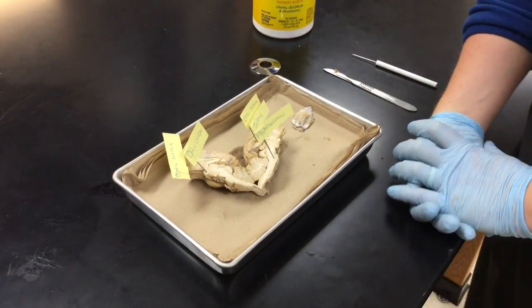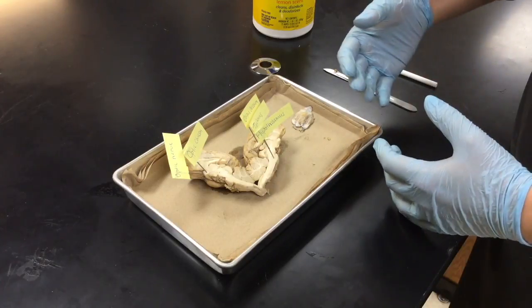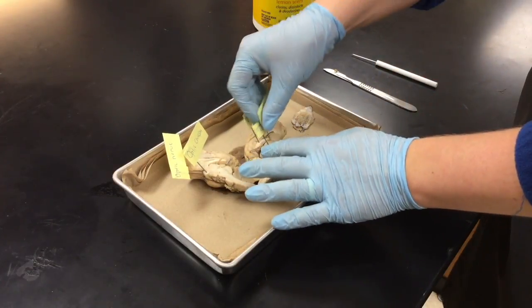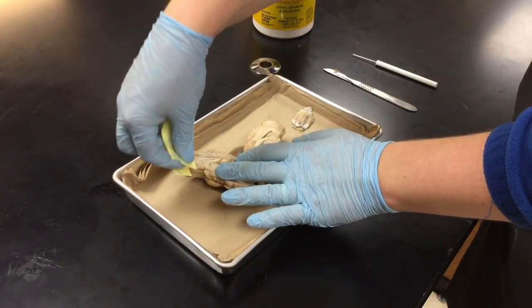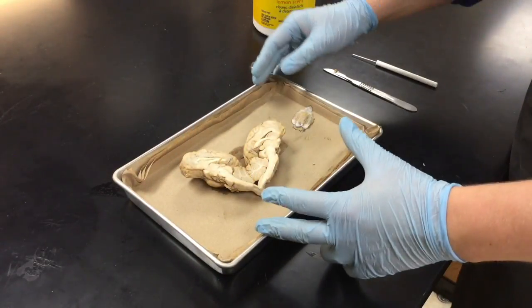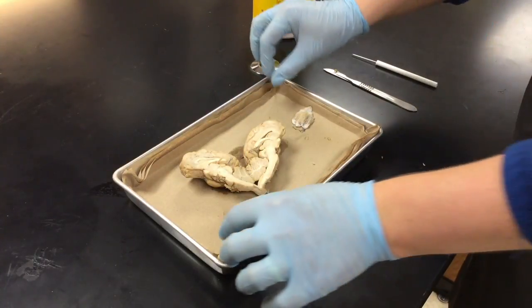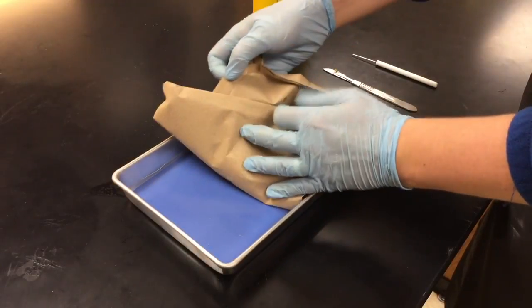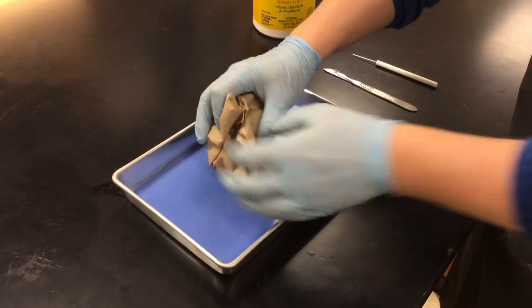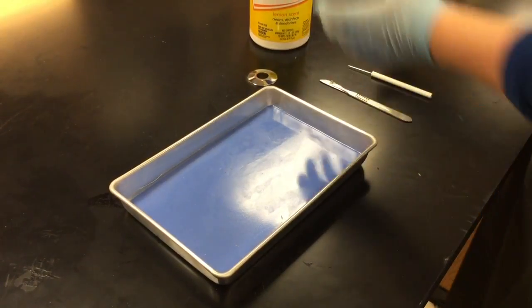Congratulations, you have finished your brain dissection, and it's now time to start cleaning up. So to clean up, what you're going to do is remove the remainder of your flags that you have within your brain. At the beginning of your lab, you probably wanted to go ahead and put these brown paper towels in the bottom of your dissection tray, because all you now have to do is take those paper towels, wrap your brain up, and put it in the specified waste container.